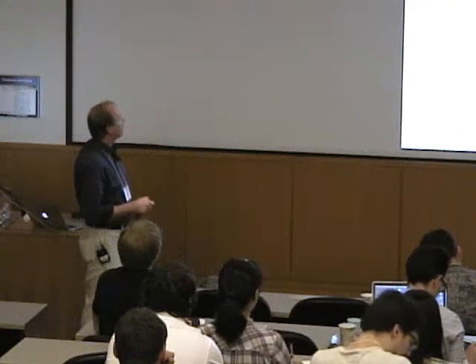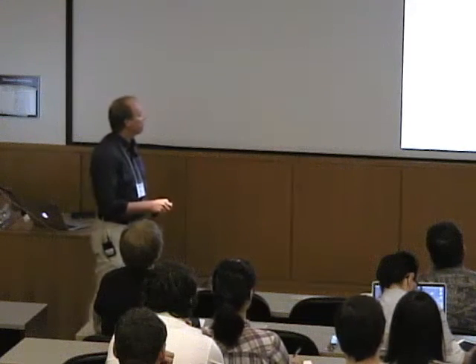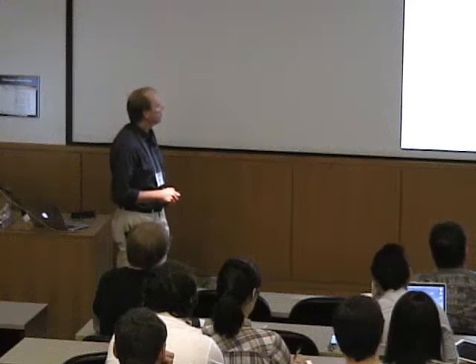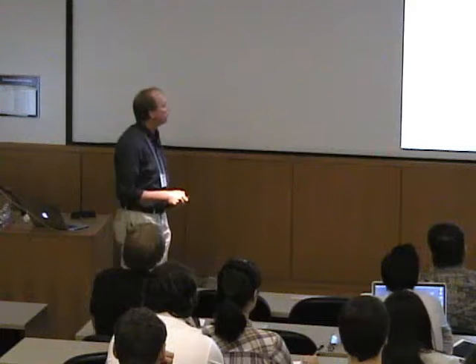And so the resonance frequencies that we work with are roughly about 600 times bigger than what you would have for, say, protons, right? So if I take a 300 megahertz proton NMR spectrometer and use the same magnet to do EPR, then I would be working at 180 gigahertz, right? And you can convert that to wave numbers, so 180 gigahertz is 6 wave numbers. So we're in the far infrared region or in the microwave region of the electromagnetic spectrum, right? So the first challenge that we have in doing EPR is that we have to work at much higher frequency than we would doing NMR.